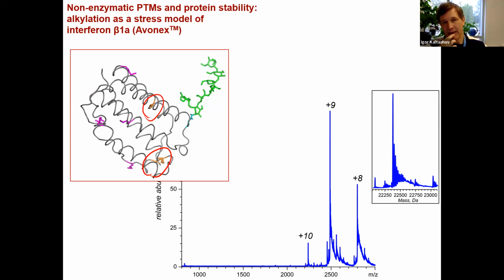So there was a company, a European drug maker, Serono. I think they have been consumed by somebody else since then. They decided to modify this protein and increase its lifetime in circulation by adding a polyethylene glycol chain here.